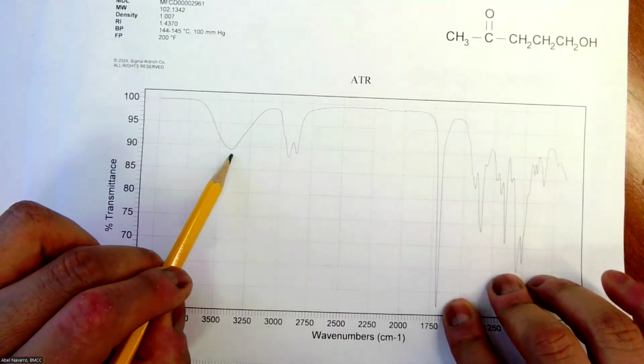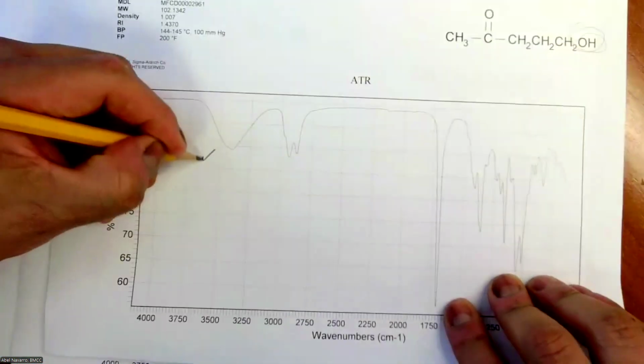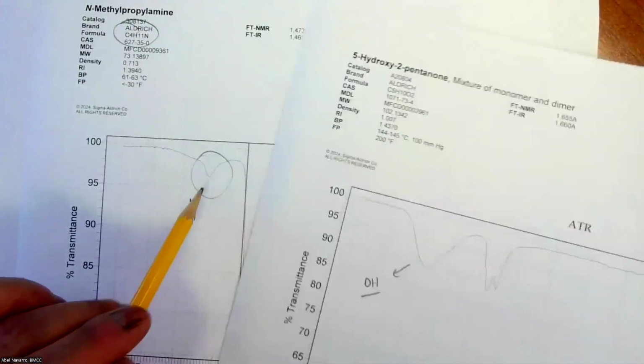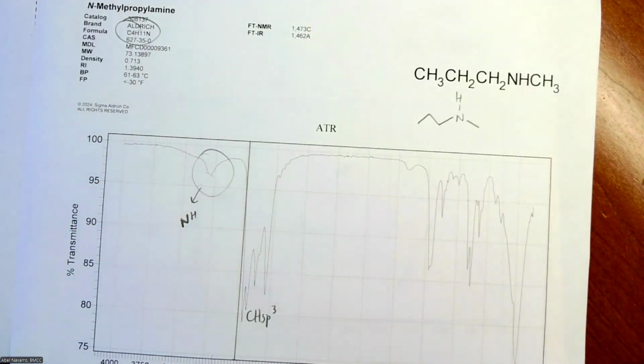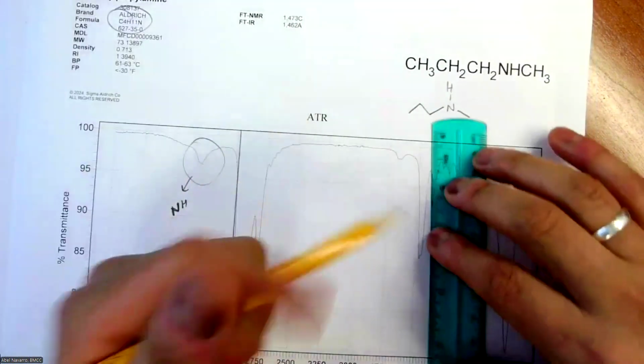For example, this one is an OH. I see it right here. That's different from that peak. See how broad it is. It's totally different. You can't mistake an amine for an alcohol.